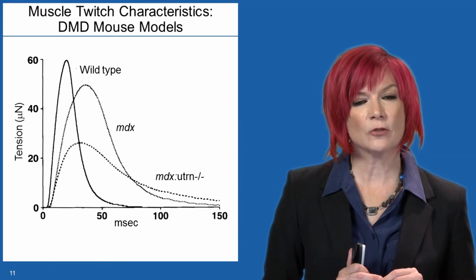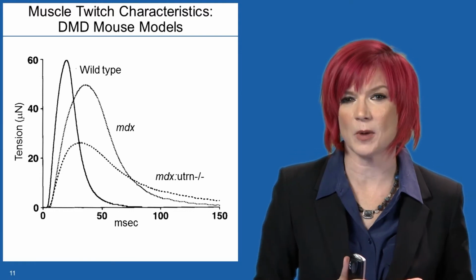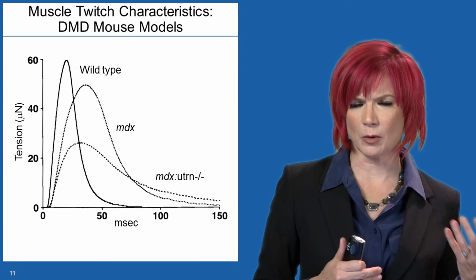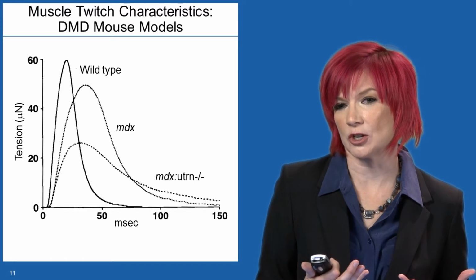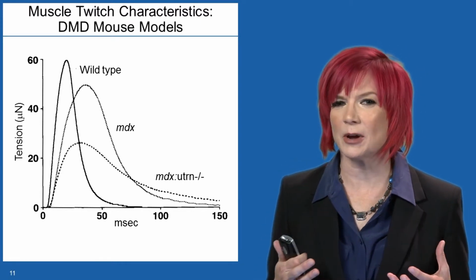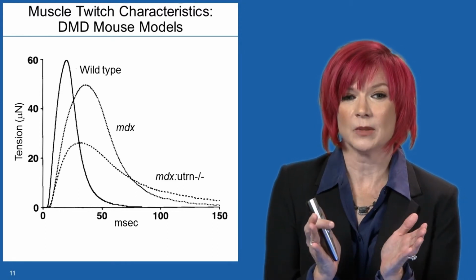So, studies on force production and EC coupling can reveal a lot of information about the muscle health. We can obtain measures like maximum force production, speed of contraction, and fatigue, which is a pattern of decreased force production across several repeated stimulations. What's really great about these physiological experiments is that we can obtain the data in real time.